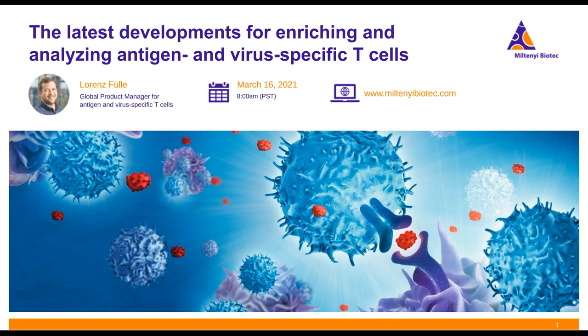Okay, great. Thank you. All right, next question. How do you achieve efficient stimulation of CD8 T cells with your peptivators?